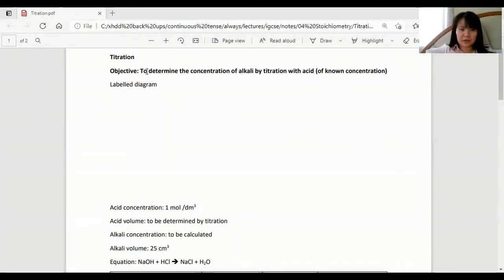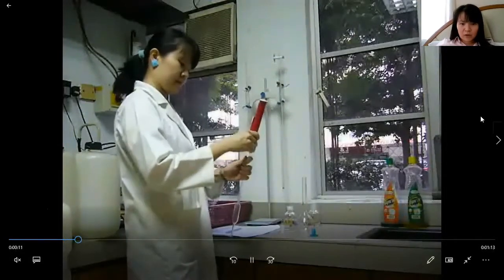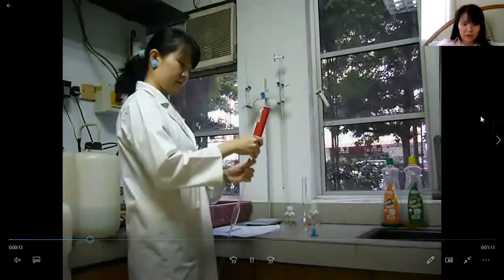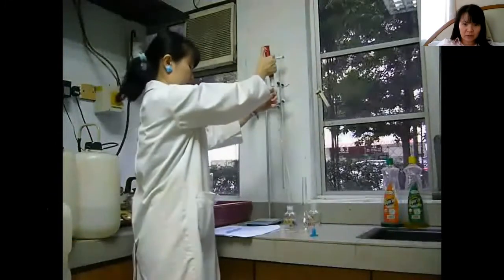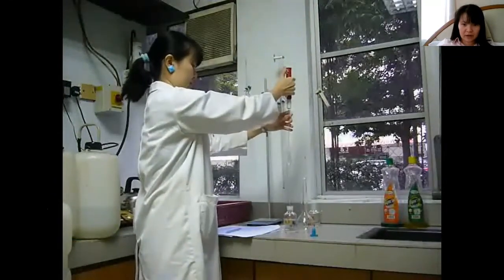This video is for the revision of titration. This is how we put on the pipette filler onto the pipette. So we hold at the very end like that so that we do not break it and cut our hand.